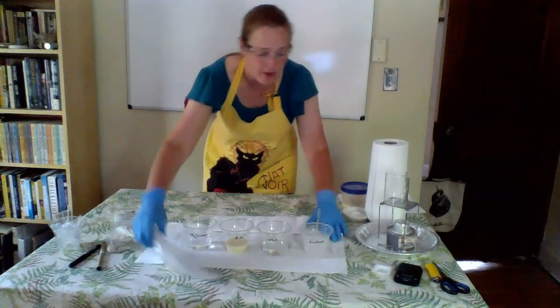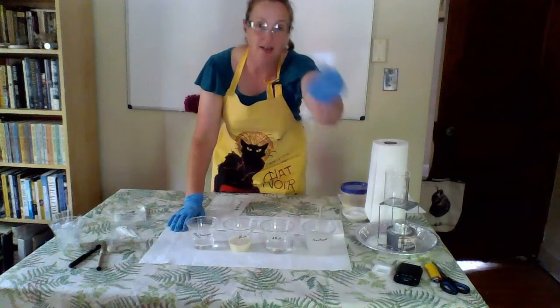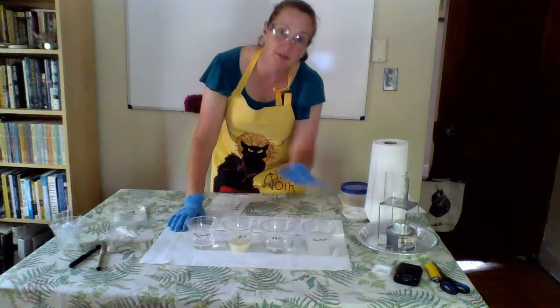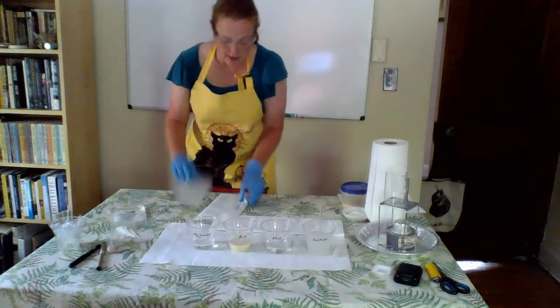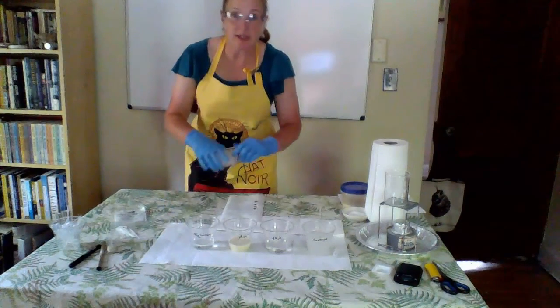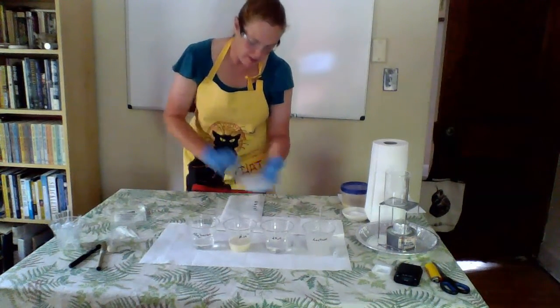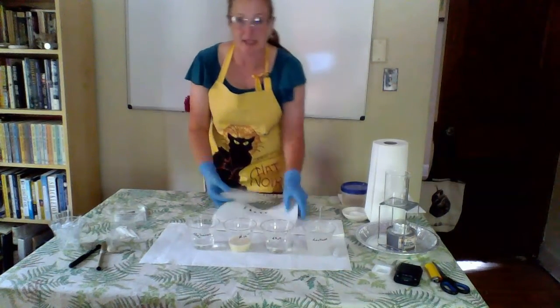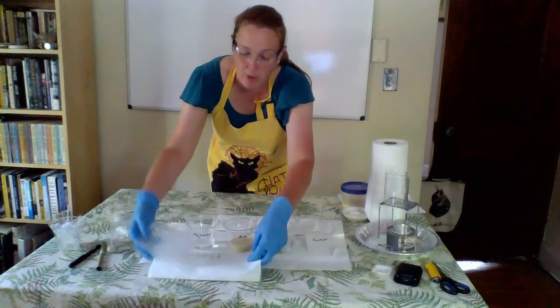So we have our 4 solutions that are made, and then I grabbed the 5th solution, the glucose that is at 20%, out of my little baggie, because we're going to need that for experiment 1. Now for experiment 1, we're going to be using these wells, and I know that the little dimples, those little indentations, are going to be harder for me to read for A, B, C, D, and E, so I just grabbed a white paper towel and wrote A, B, C, D, and E.